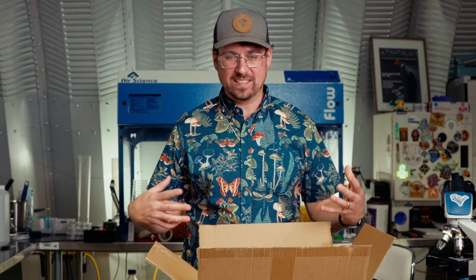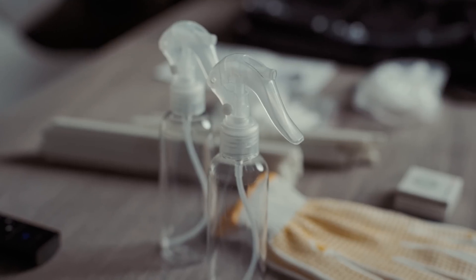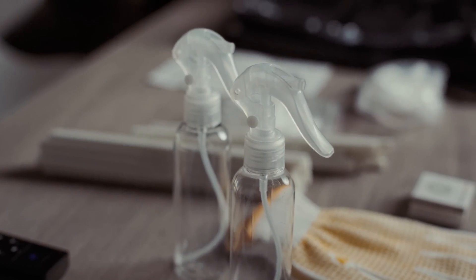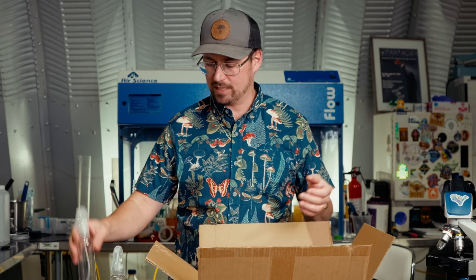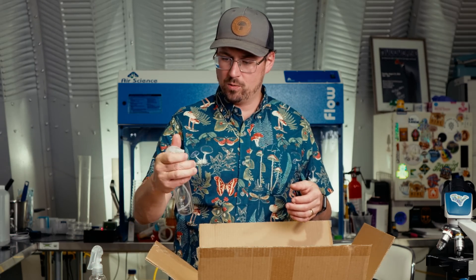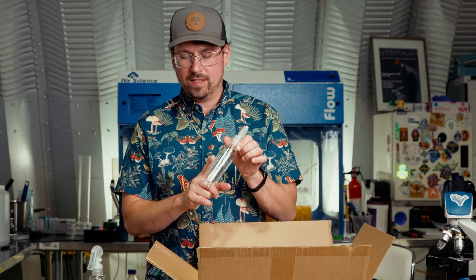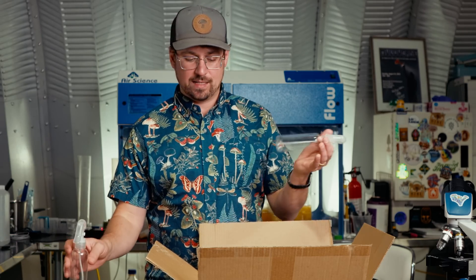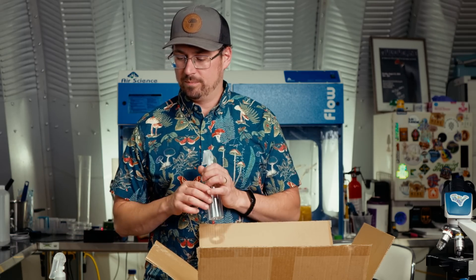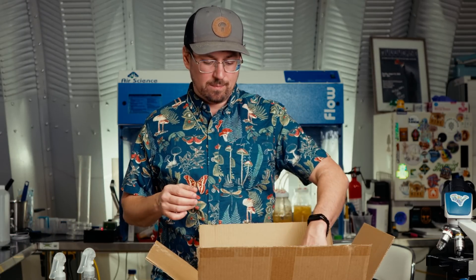As I'm diving into this box, I noticed they have some nice spray bottles. The fact that there's two of them — I don't know why you'd need two unless they're not good quality and they expect one to break. But this is a cool feature of this kit. Essentially, one of these I would fill with isopropyl and then keep the other on hand in case this one breaks or maybe you want a free plant mister. Anyway, we've got our two spray bottles.